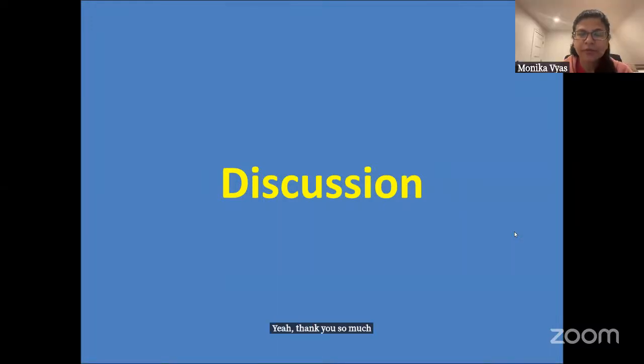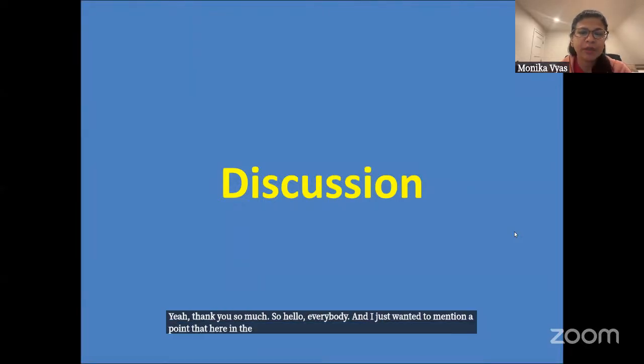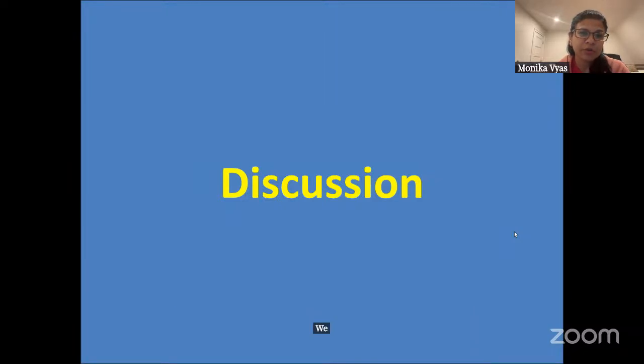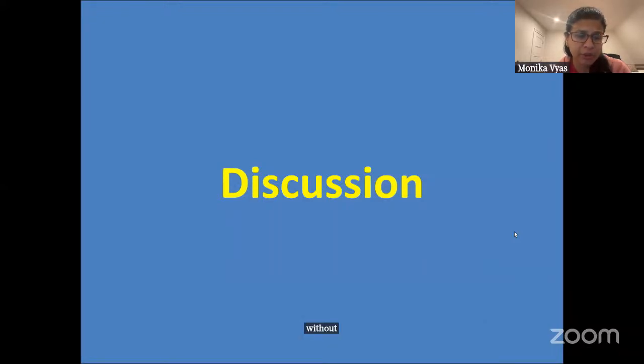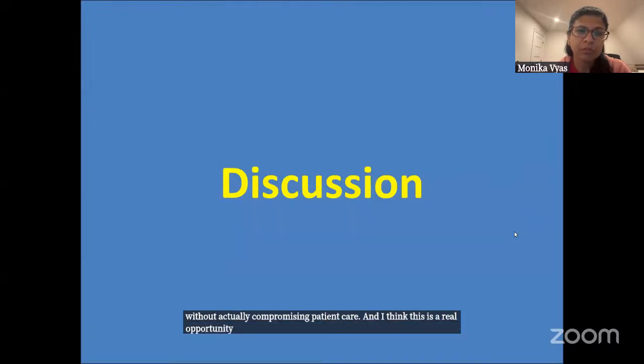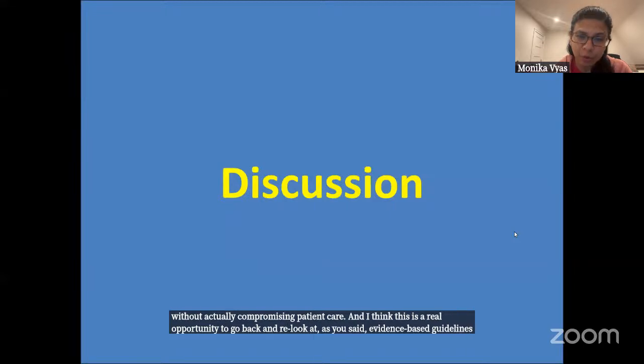So, hello, everybody. I just wanted to mention a point that here in the US, particularly in the post-COVID era, we're facing an acute shortage of histotechs and lab staff. So we are definitely strained for resources. Currently in our department, at least, we are in the process of reviewing our grossing SOPs and guidelines to see how we can minimize the burden on our lab without compromising patient care. I think this is a real opportunity to go back and relook at, as you said, evidence-based guidelines, or even come up with our own evidence.